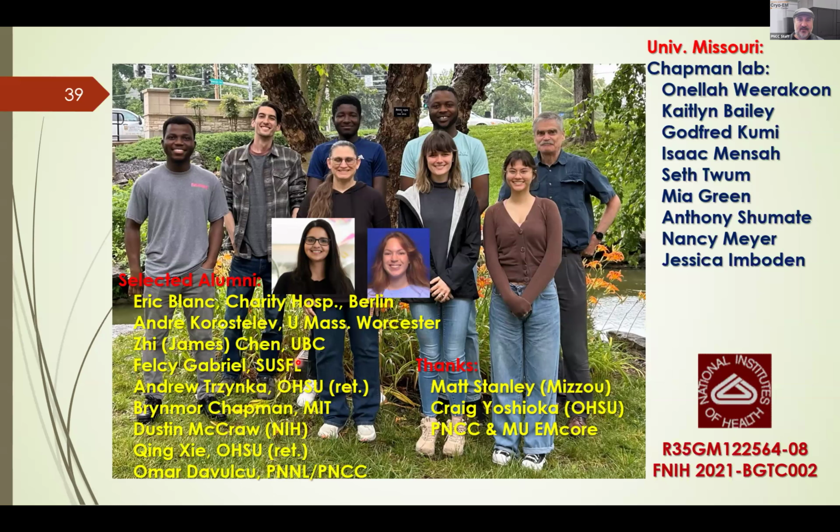Can you tell us a little bit about your workflow? So you've got a capsid map that you can presumably fit those atoms into really well. From there, how do you go to those images you were showing us? Yeah, all of the images that I was showing were based upon just standard reconstructions.